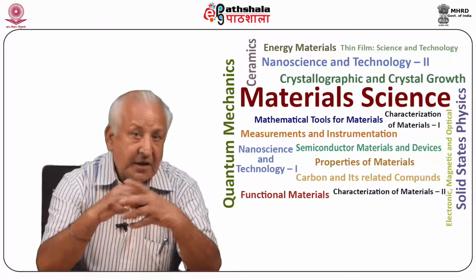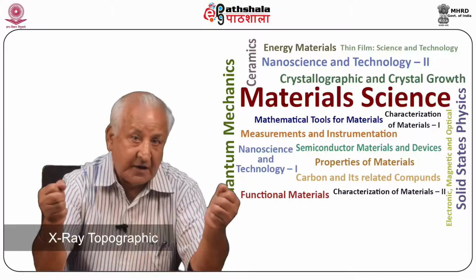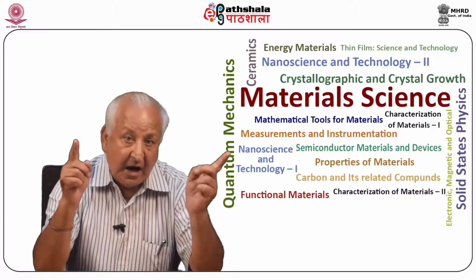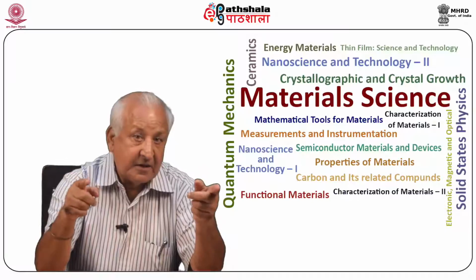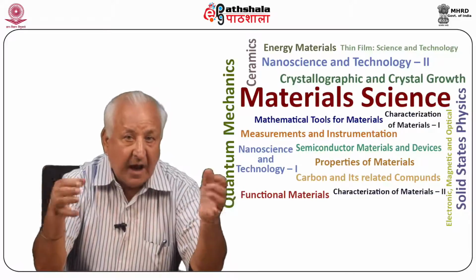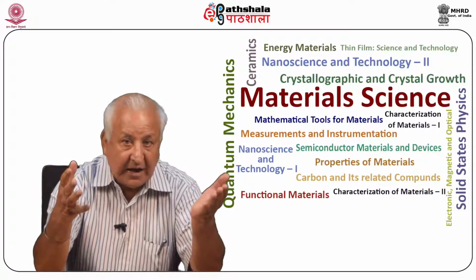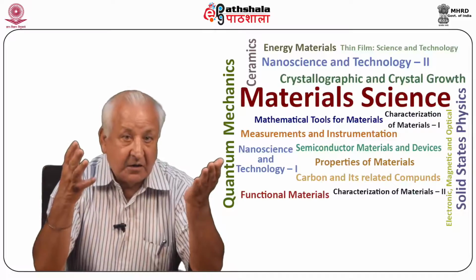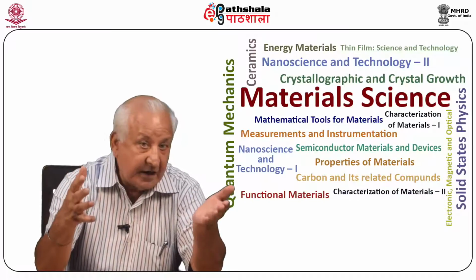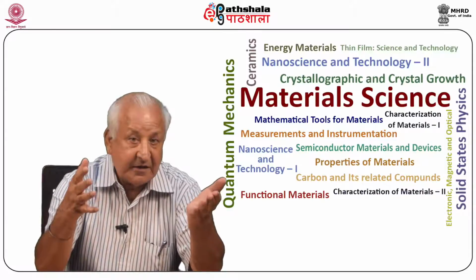Advances have been made in recent years to improve the efficiency and sensitivity of X-ray topographic and experimental techniques. Using high brilliance and a high power source, the exposure time is greatly reduced. X-ray generators of the rotating anode type have been used with great success. This type of generator with electrical power of 30 kilowatt is available. Synchrotron radiations at a wavelength of 1 angstrom have the potential for a great future in the field of X-ray diffraction topography.